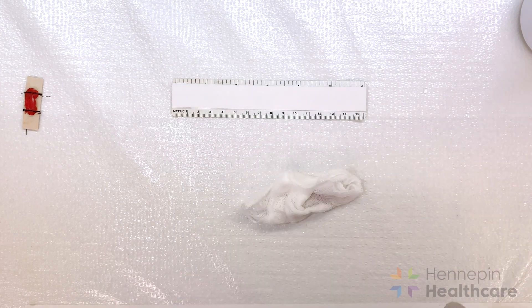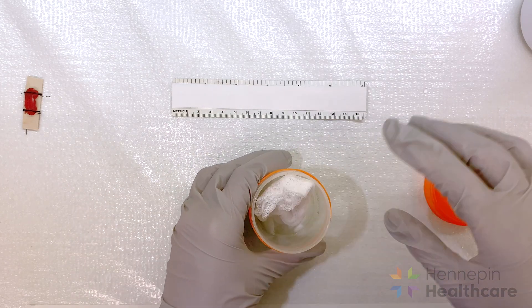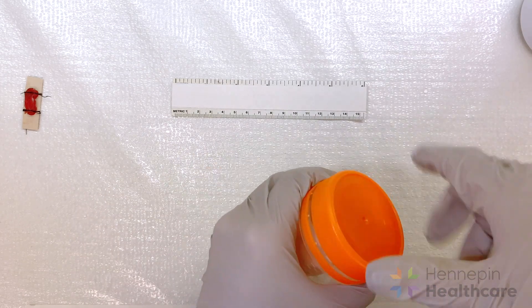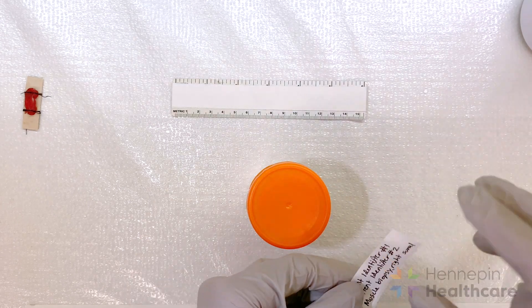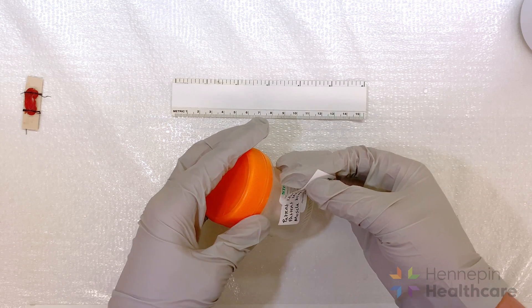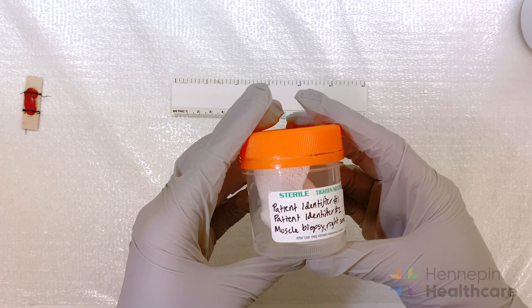Place the muscle wrapped in gauze in an airtight container labeled with at least two patient identifiers, as well as the time and date of biopsy.